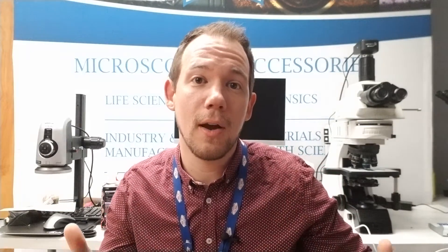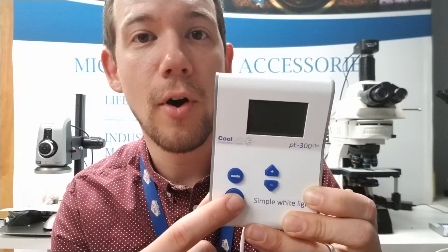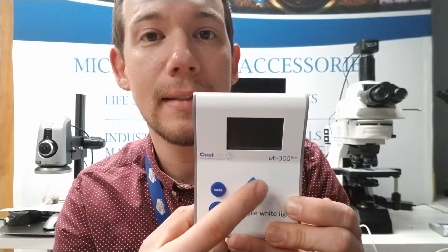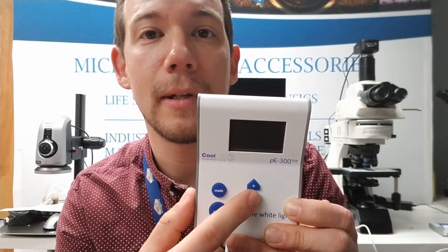The pE-300lite has a broad-spectrum white light output that covers a broad range of filters. Looking at the pE-300lite controller, we have our on/off button and then intensity adjustment from zero to one hundred percent in one-percent increments. The pE-300lite is a good option if you just want to replace a mercury or metal halide system, especially if you don't need to connect the light source to software to control it.